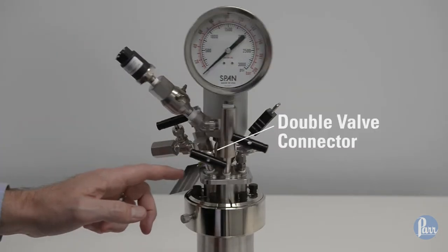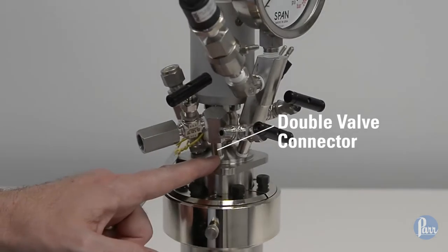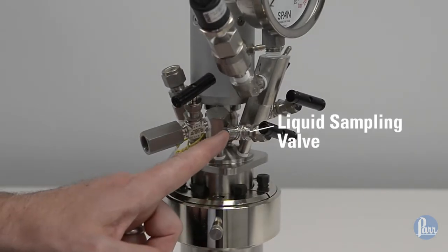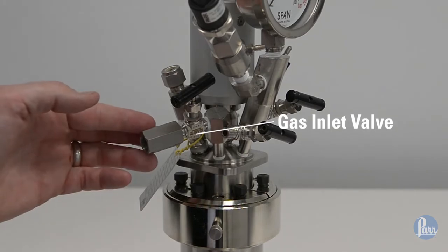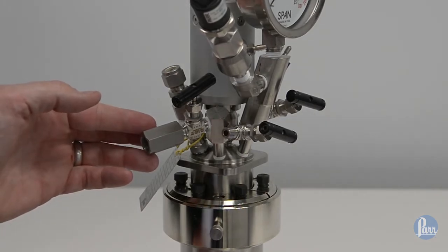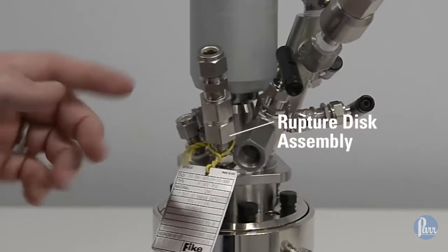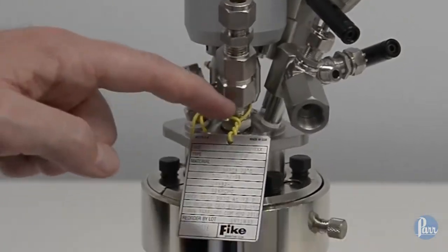As we proceed clockwise, we find the double valve assembly connected here, to which both a liquid sampling valve and a gas inlet valve are connected. Next is the rupture disc assembly with tag that shows the burst pressure of the rupture disc mounted in the head fitting.